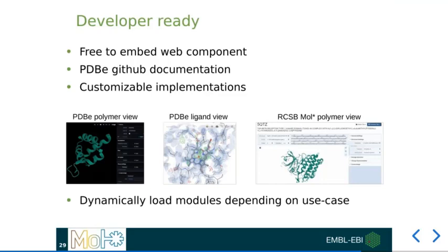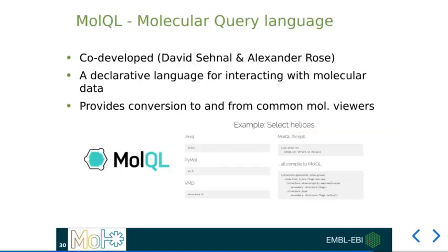Firstly, it's simple to embed on any website or indeed presentation, as I hope I've been able to show today. And it also comes alongside extensive documentation, which is available through its GitHub codebase. Then, as you have also seen today, specific instances of MolStar can be tailored to specific use cases. We already have several variants between different PDBe resources, and whilst the core components are lightweight, more complex modules can be loaded individually to help keep data transfer and processing to a minimum. If you already have scripted viewers that you use or implement on your own websites, MolStar was developed alongside a new query language, MolQL, and this can help in the transfer of existing scripts to the MolStar environment.